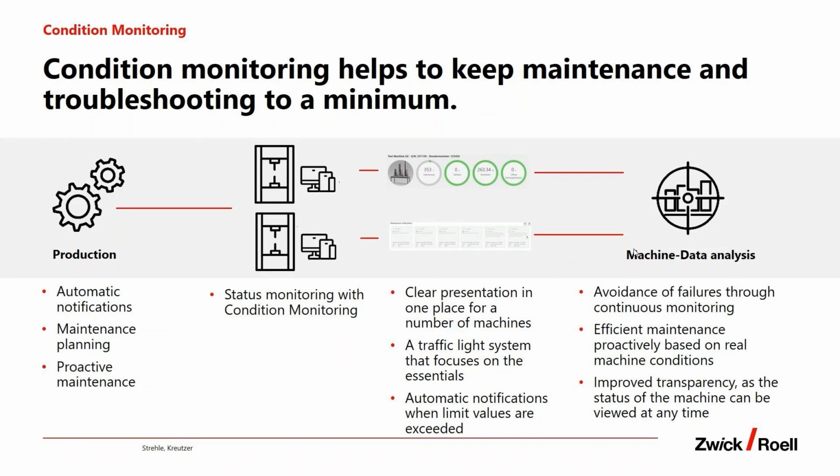Daniel. So this is feedback from one customer who bought condition monitoring because he said, from my point of view, I have a machine close to production and I want to know immediately when an overload is happening. In earlier times, he didn't get it from the colleagues, so maybe 3 weeks after.